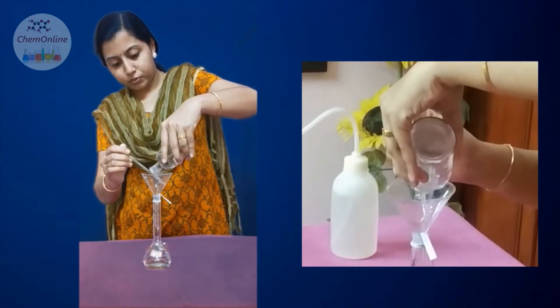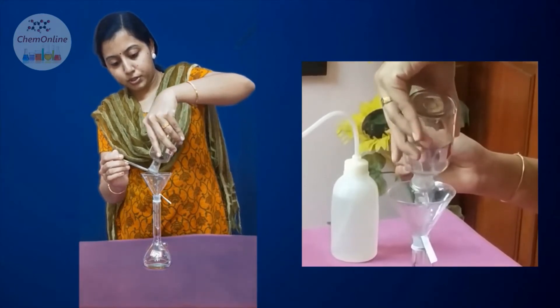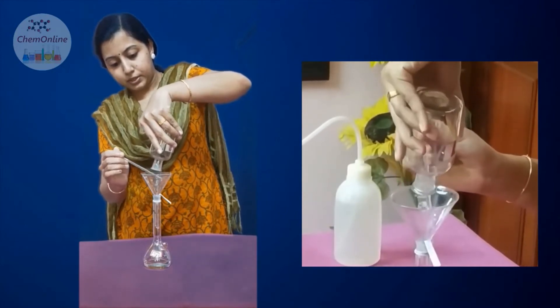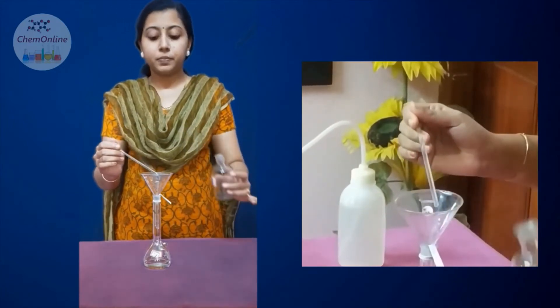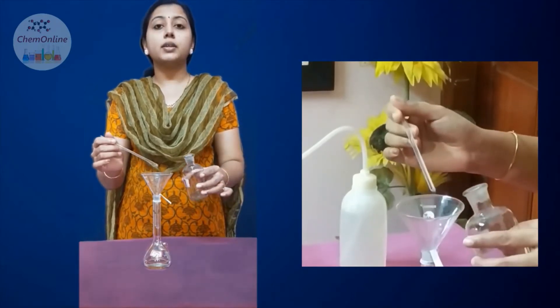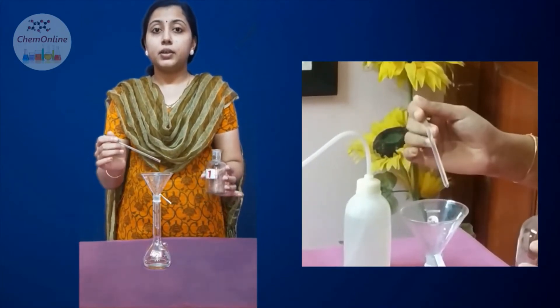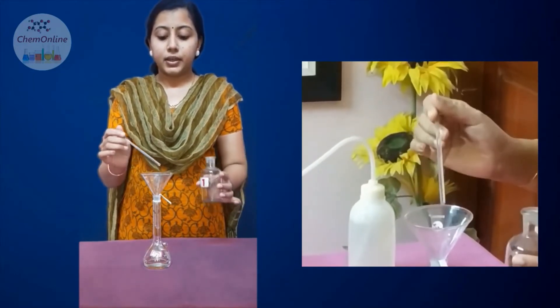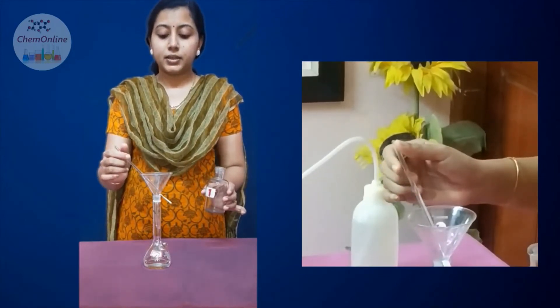When the volume of the solution decreases, you have to tilt the glass rod to almost a horizontal position so that the last of the solution will be transferred. After transferring, you can either keep the glass rod inside the funnel or inside the solution bottle — but never keep the glass rod on the bench or any surface elsewhere. Either in the funnel or inside the glass bottle.